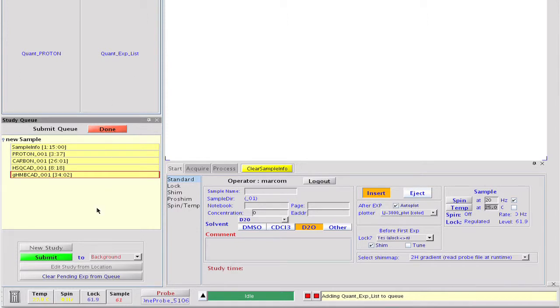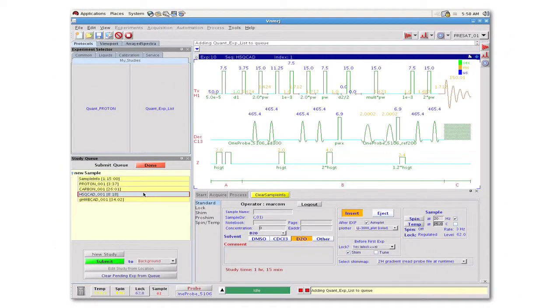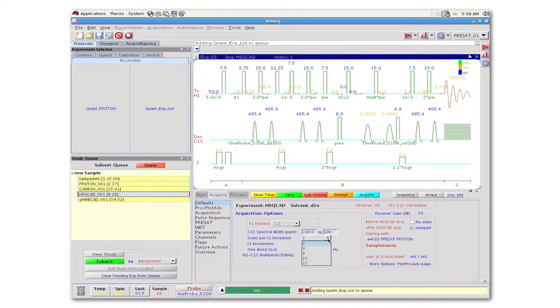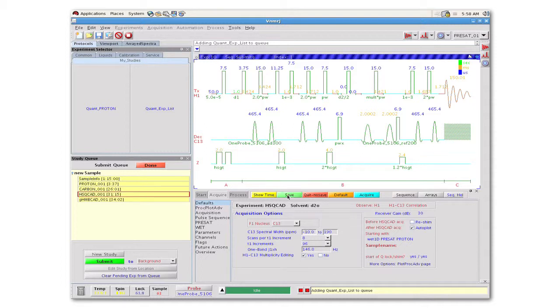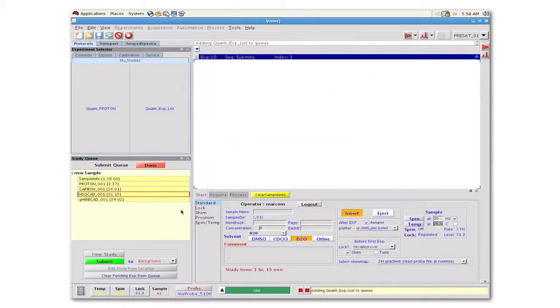It is worthwhile to note that the experiments created using a study clone are fully customizable after they are loaded onto the study queue. Even though our new Study Clone button gives us the same parameters that were set when it was created, we can still choose to change any or all of the experiments in the list if we so desire.